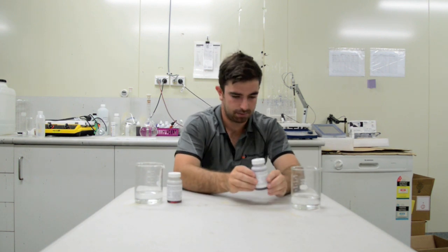Once all the medium has dissolved, place in a warm area out of direct sunlight and leave for 48 hours.